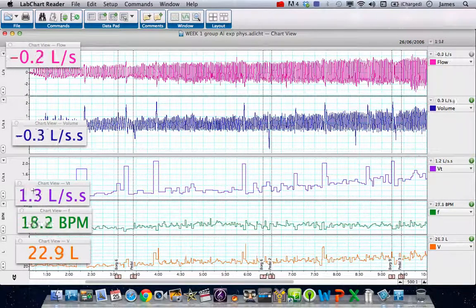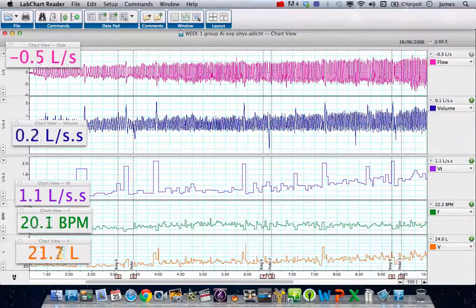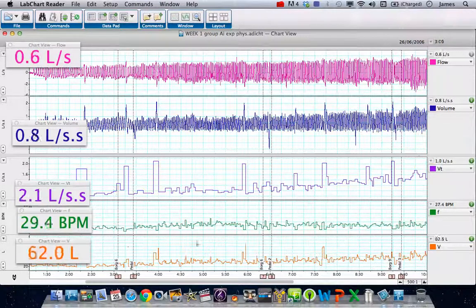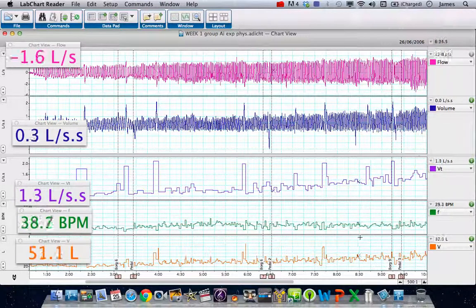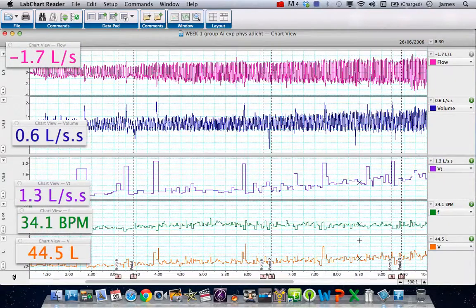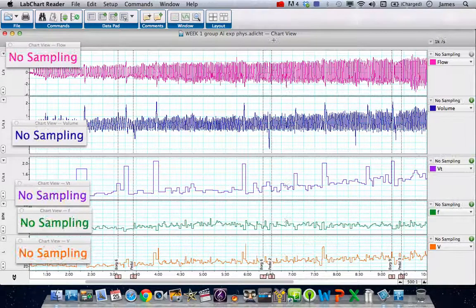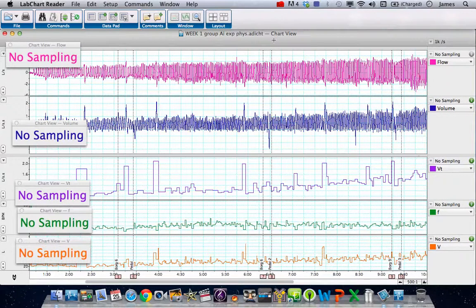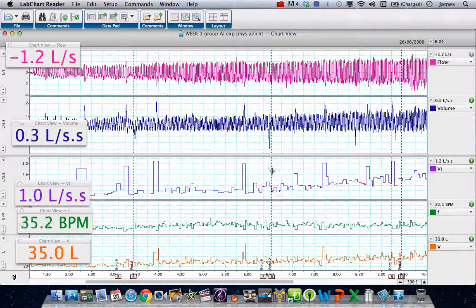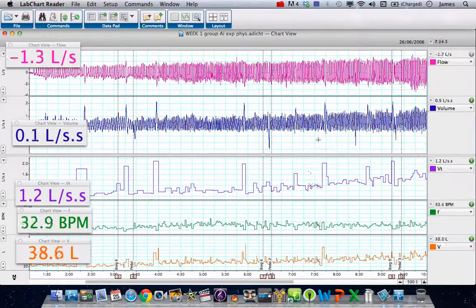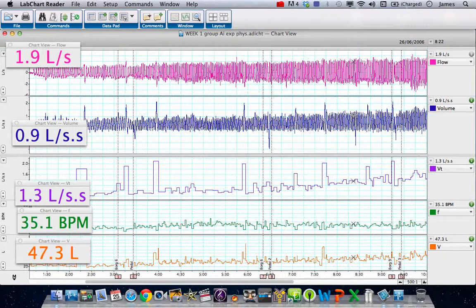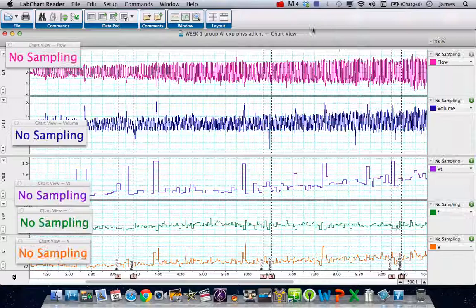On the left hand side we've got here VT, here F and here minute volume. And you can see as this person has done more and more exercise, values have changed according to what we'd expect with physiology. So I hope that helps. Remember I'm not a respiratory physiologist, but this is a quick rundown of how to do some basic analysis using that chart.